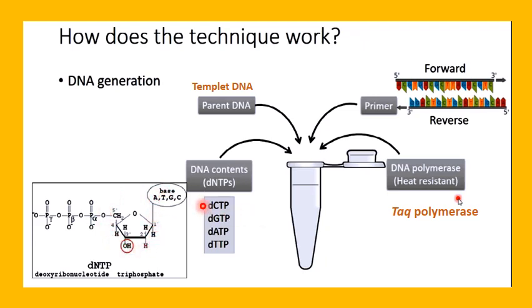All these components are added separately.